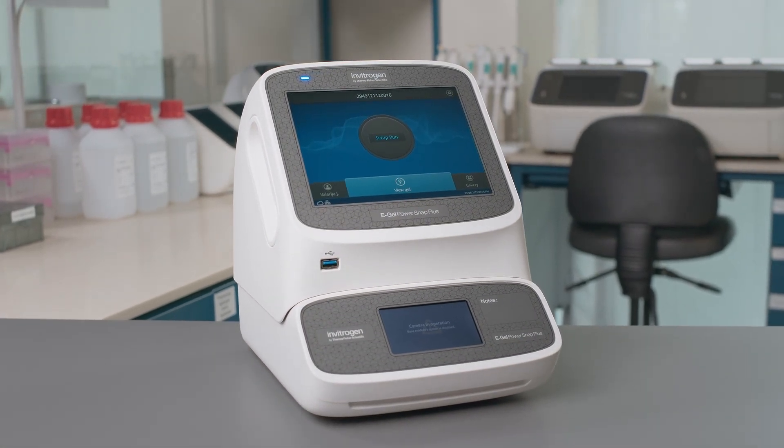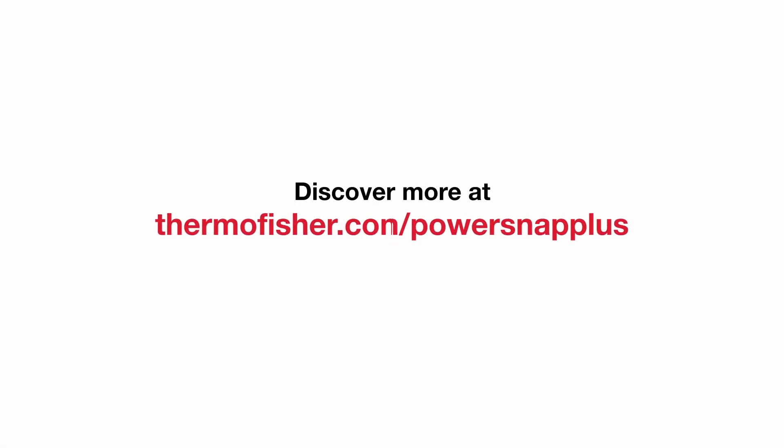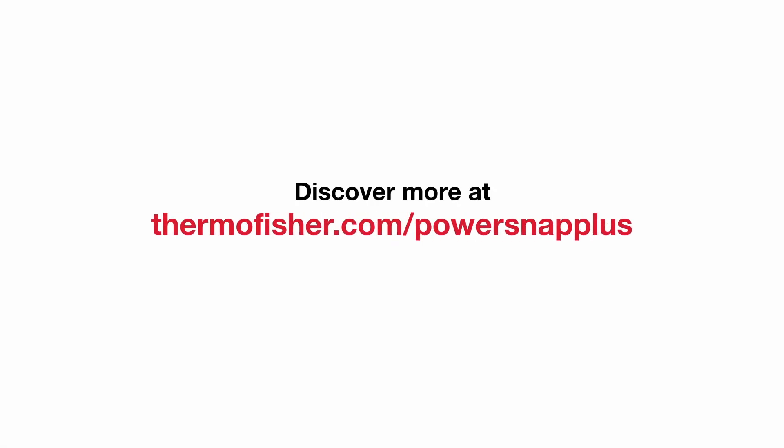The eGel PowerSnap Plus Electrophoresis system — streamlining your nucleic acid electrophoresis workflow. Discover more at ThermoFisher.com/PowerSnap Plus.